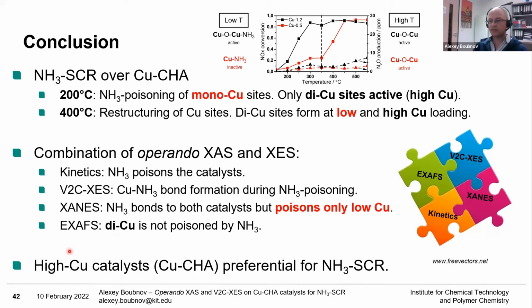And finally, we can conclude that the higher loaded catalyst zeolites are supposed to be the more preferred for ammonia SCR. So putting all the puzzle pieces together, spectroscopic techniques with kinetics, we understand the importance of Operando spectroscopy.